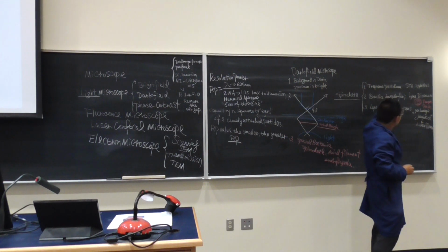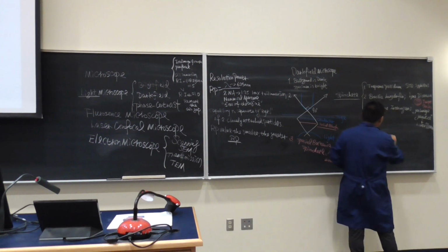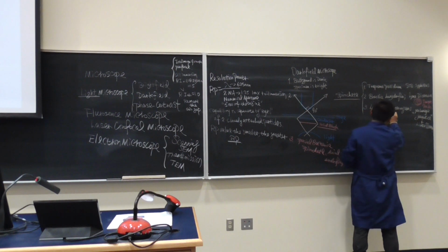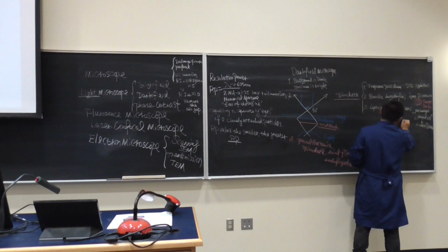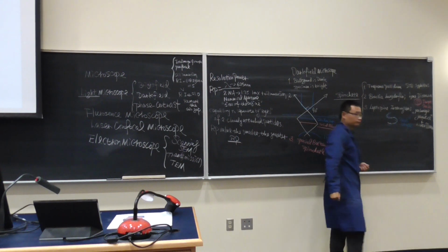Now we mentioned that these two have very good characteristics. How about Leptospira interrogans? What does it look like? It looks like this. A hook shape, a very typical hook shape. It shows a very good color.